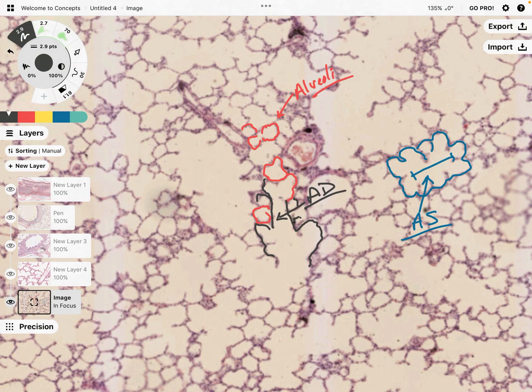And for me particularly, I often associate that with grapes. So this is like a grape cluster off that vine, and that vine being that terminal bronchiole and that alveolar duct that basically feed into these clusters of grapes.